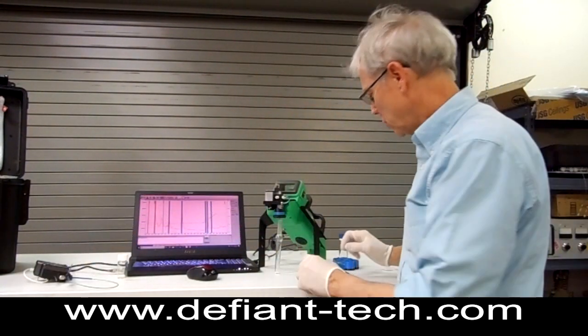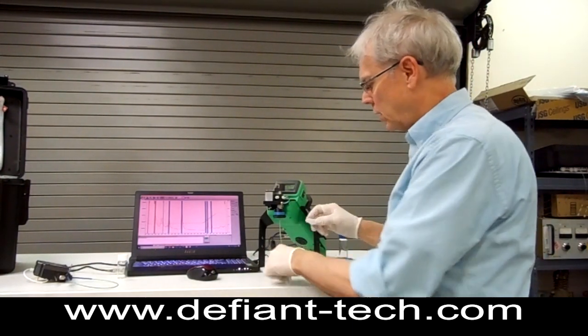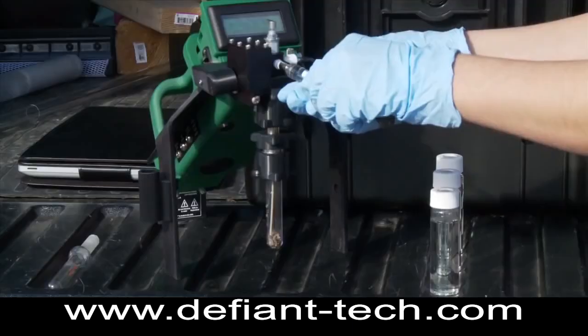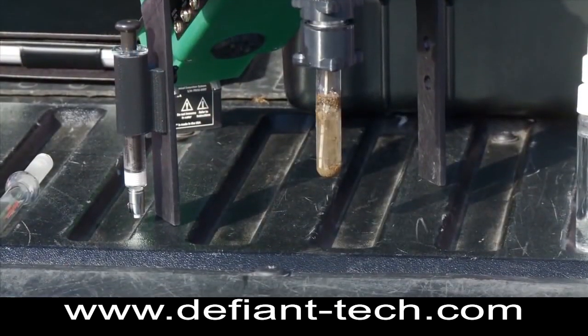If you're running soil samples, you can simply measure out one gram of soil, add it into the sparge bottle, load in five milliliters of water and you can run soil samples.